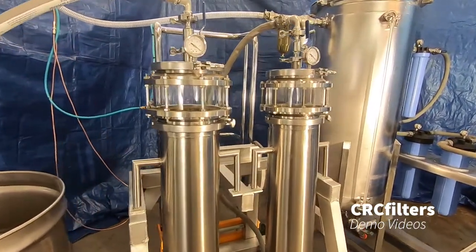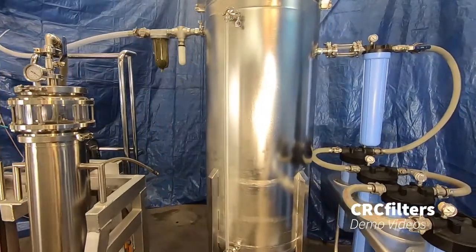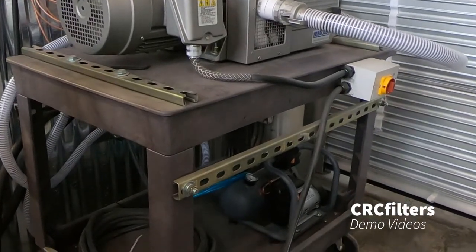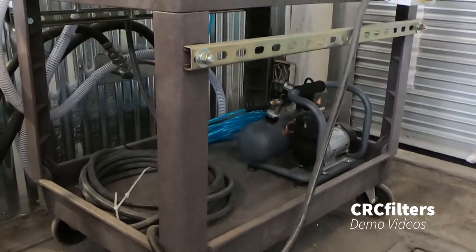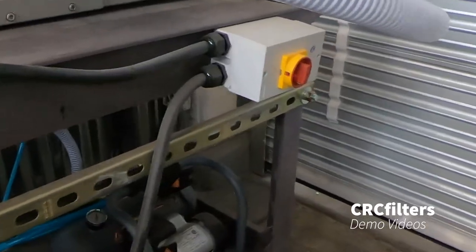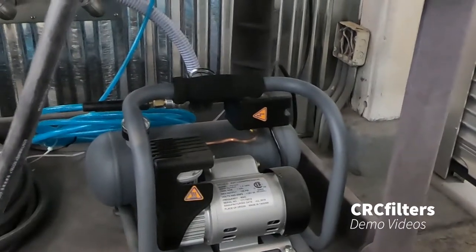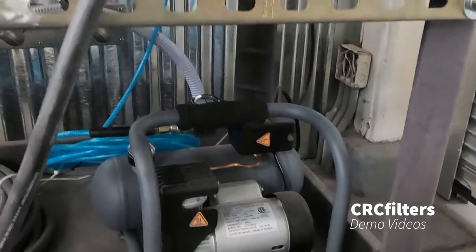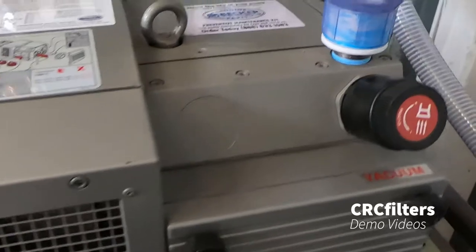Here we have our vacuum pump and it's mounted on a cart. We've got a 50-foot cord going to the switch. We've got our air compressor — a little air compressor here — that operates the pneumatic lift that the extractor columns are mounted on to raise up and down. This is a Becker vacuum pump.